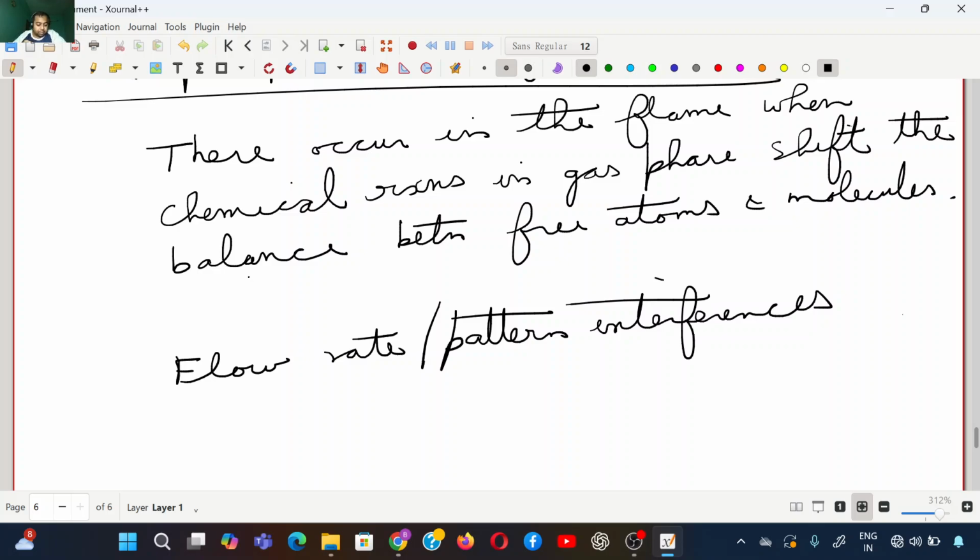So if I were to summarize, I'll just say that atomic absorption spectrometry is very powerful, but also highly sensitive to interferences. Solvents, salts, organic matter, flame chemistry, gas flow, all influence how many free atoms are produced. So you have to be aware of these facts so that you can get measurements that you can rely on. Okay.